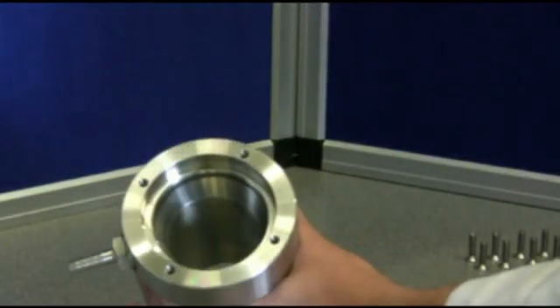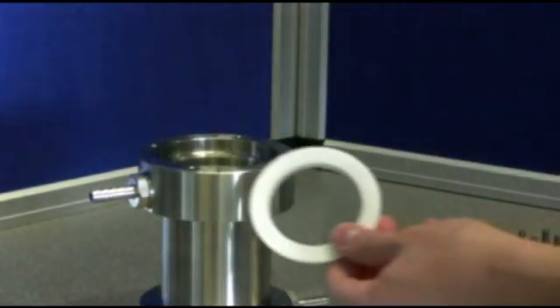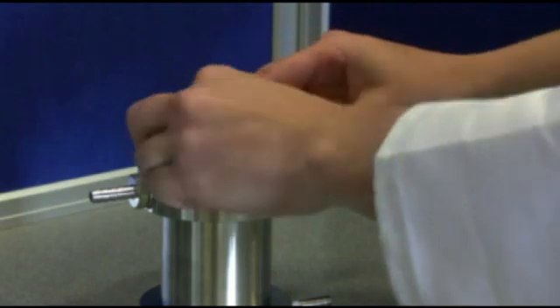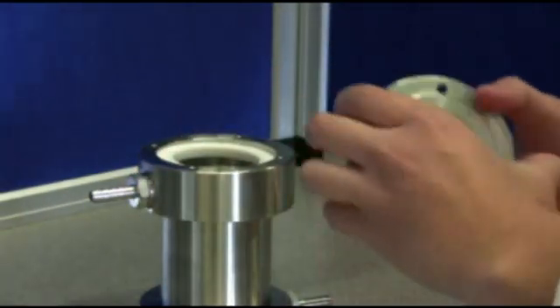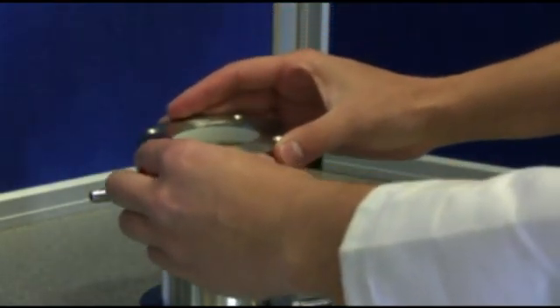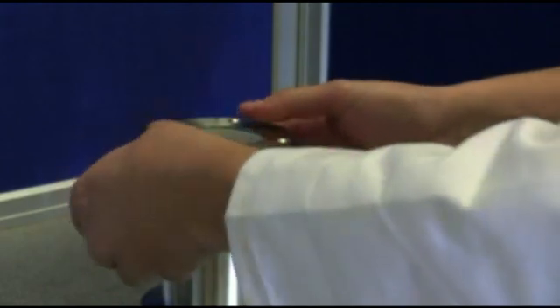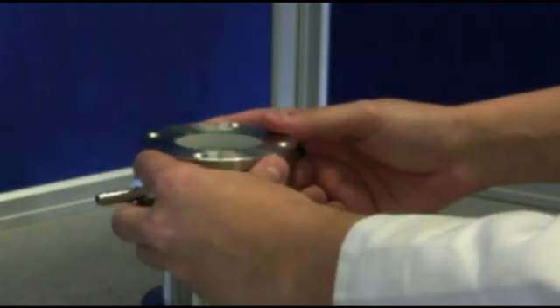The shaft sits inside the external shroud, which is all stainless steel construction. There's PTFE sealing rings. And the top has a guide ring in order to position the central shaft centrally. That simply fits on the top.